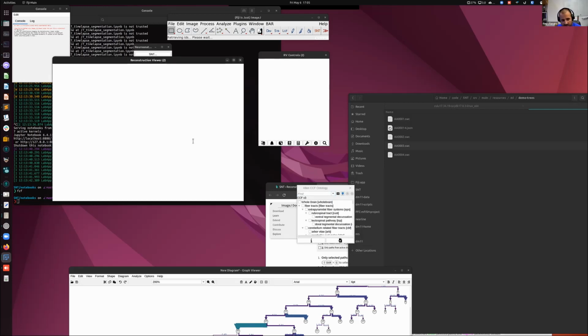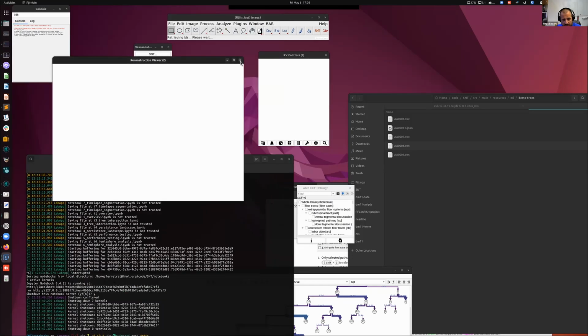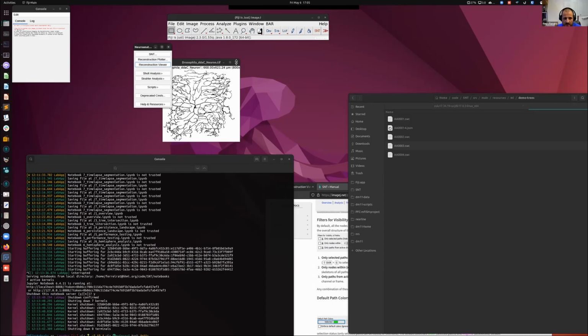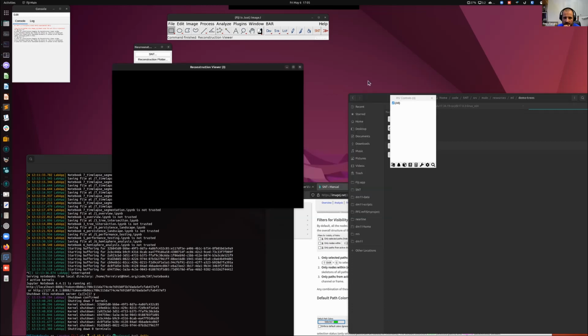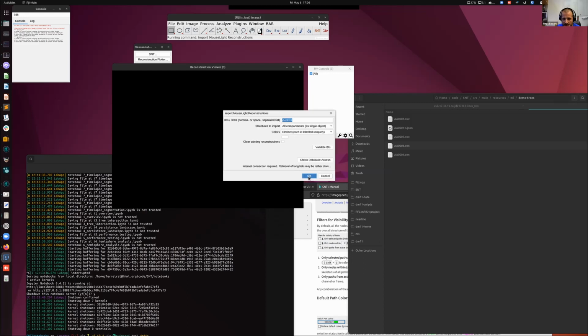Okay, I think my computer is... I'm just going to start the graph viewer. Okay, I think that was the problem. You were still connected. Okay, let's start fresh. I left a pending operation that was slowing down my computer. So I'm going to load the database, mouse light, again, one neuron.